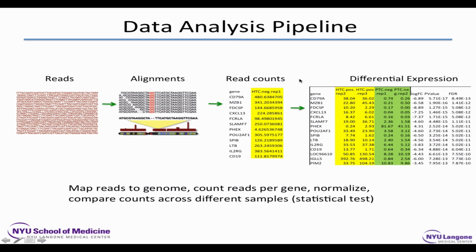And then after we do some counting, we're going to compare treated versus control, yellow mice versus white mice or whatever. Typically, you would do this with several replicates. The more, the better. Today's exercise is simplified. We're just going to use 2 files, one for treatment and one for control, or treatment A versus treatment B in this case.